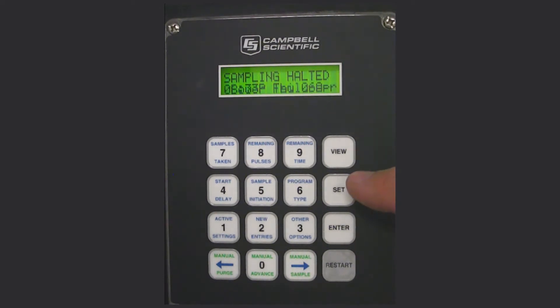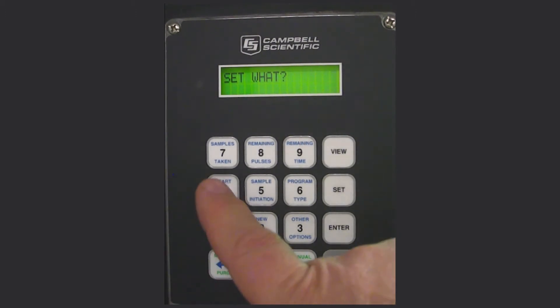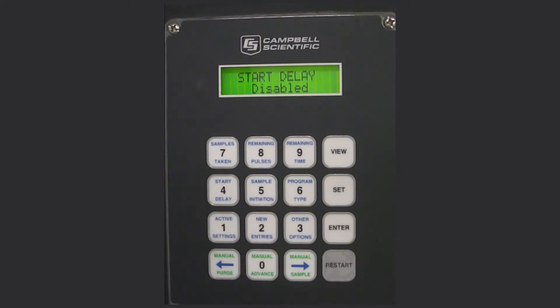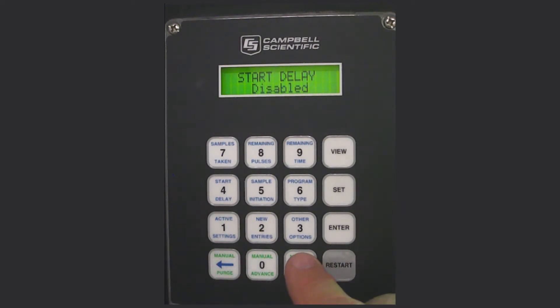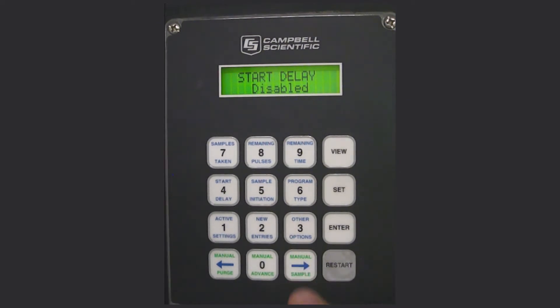The simplest and easiest way to program the sampler is to push SET, then push number 4. In this case we want it to say disabled. If it doesn't come up with disabled, push either the left or right arrow keys until it does. As you go through it you'll see options: time day, pulse input, 4 to 20 milliamp input, external contact, level control, and disabled. We want to leave it there.